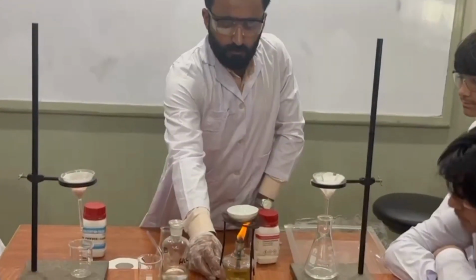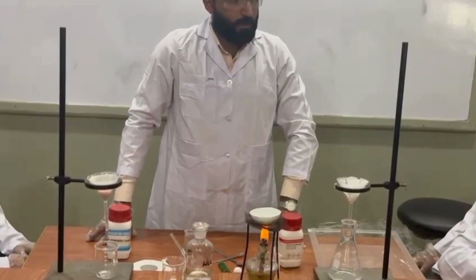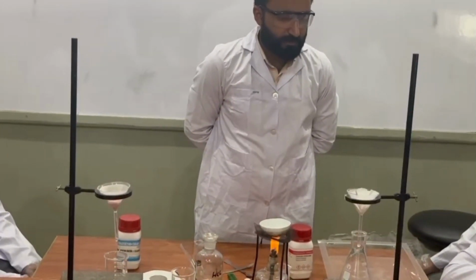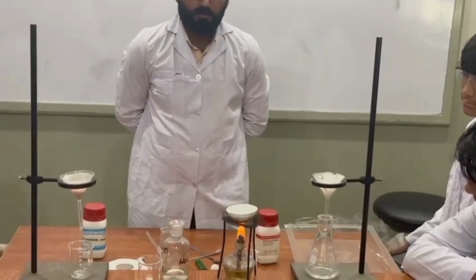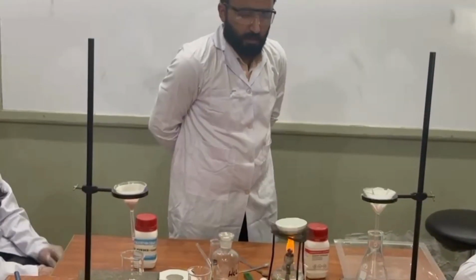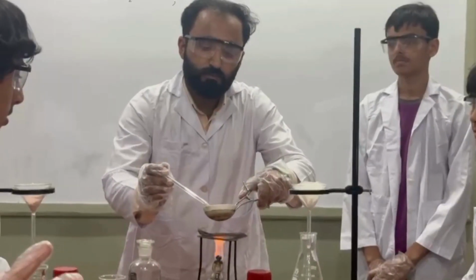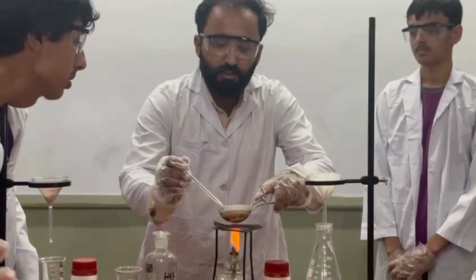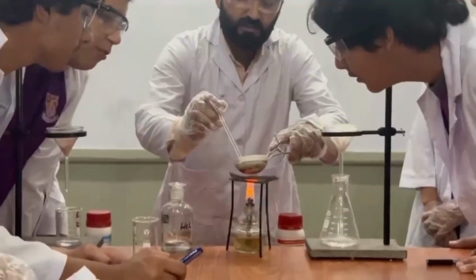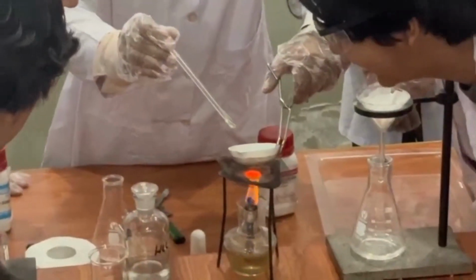Sir, how much time will it take? It will take only 5 minutes. Let it cool down. It's dangerous, it can harm you. Okay, please wait for the crystallization process. Oh wow, dear students, you can observe the formation of crystals. Yes, sir, these are the salt crystals. They're very big.